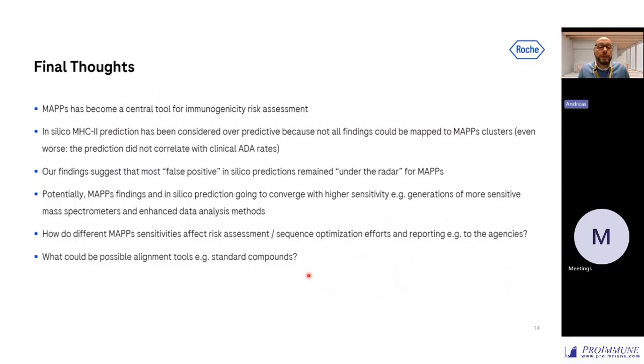And there could be possible alignment tools, standard compounds, but we all know that standardizing assays or distributing such compounds and so on comes with its own challenges. So that might not be the solution for everything, but at the end, as usual, we just should be critical with looking at those data.